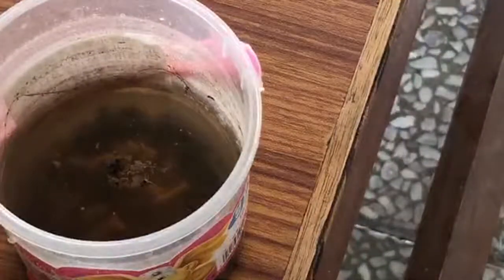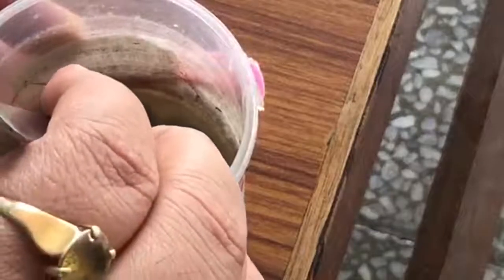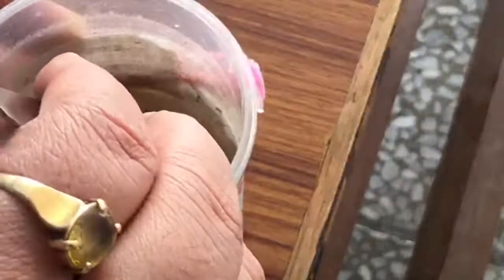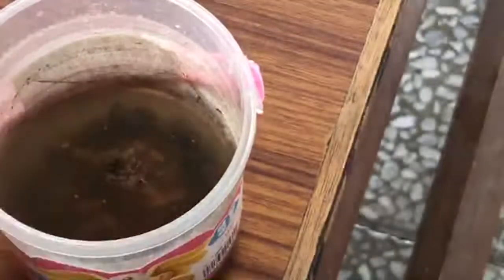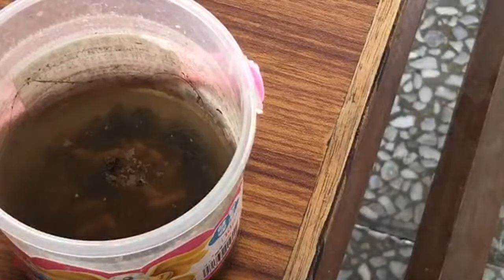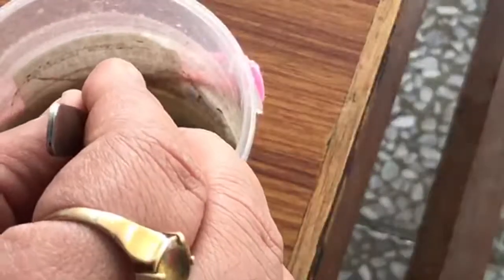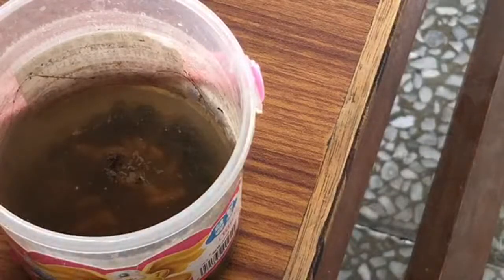I'll be collecting this whitish thing, a small part of it. That's enough. That's too much, in fact.